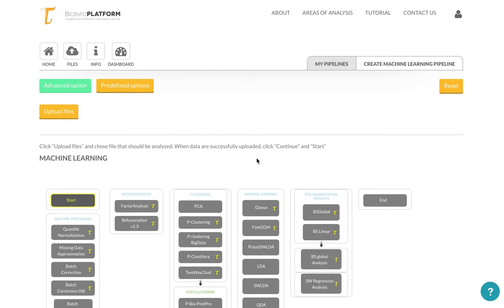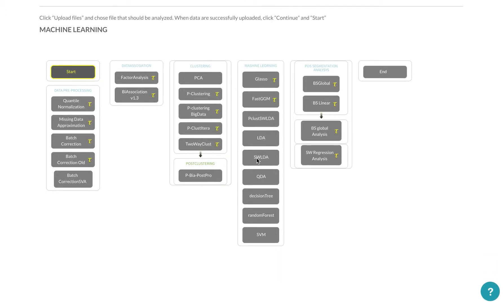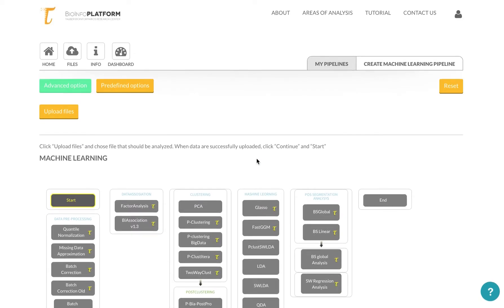Typically you would upload a table that you got from one of the previous sections. For example, in RNA-Seq you would get a table of gene expression, and then you can upload that table here and perform algorithm analysis. As you can see, the data type selection is missing here, but it's expected that you're uploading a table.